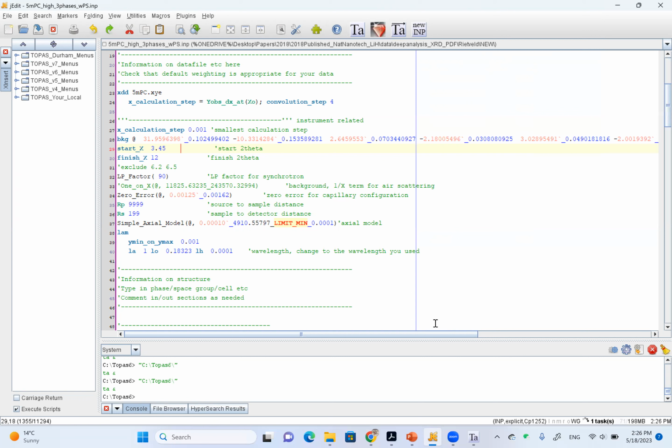So we need the background. We need to fit that one, and that is very important for interface samples for the reason I just explained. We have huge backgrounds, and from my experience, the tricky part is you need to figure out how many polynomials you want to vary per background. Because background function in essence is a polynomial.